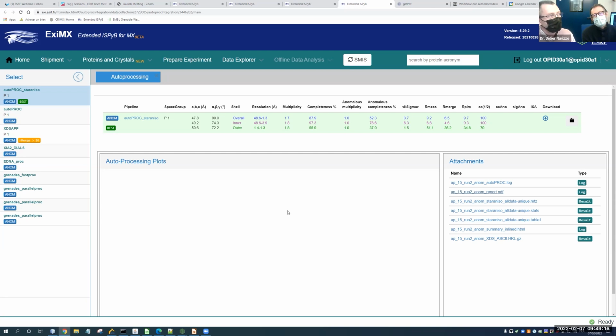But what I would say is that if you played with your fudge factor for the radiation tolerance, it might make a big difference. If you have slightly higher tolerance on radiation, you can squeeze a bit more resolution out. Best will push that a bit further. Would you say like 0.9, 0.8 instead of 1? 0.5 I would push it to. If it's quite robust, then that should be all right. Again, if you have a feeling like this, Pedro, we can try it on 3 or 4 samples and see if it makes a difference, and then put it back again, in discussion with you.